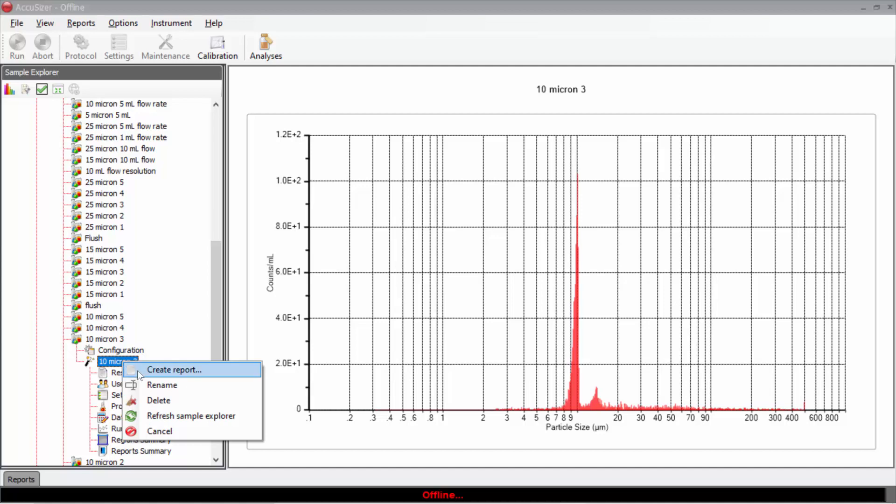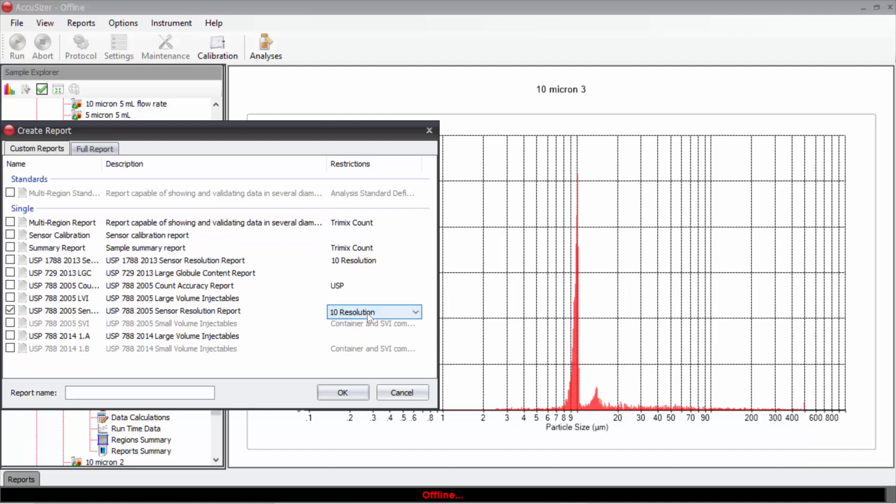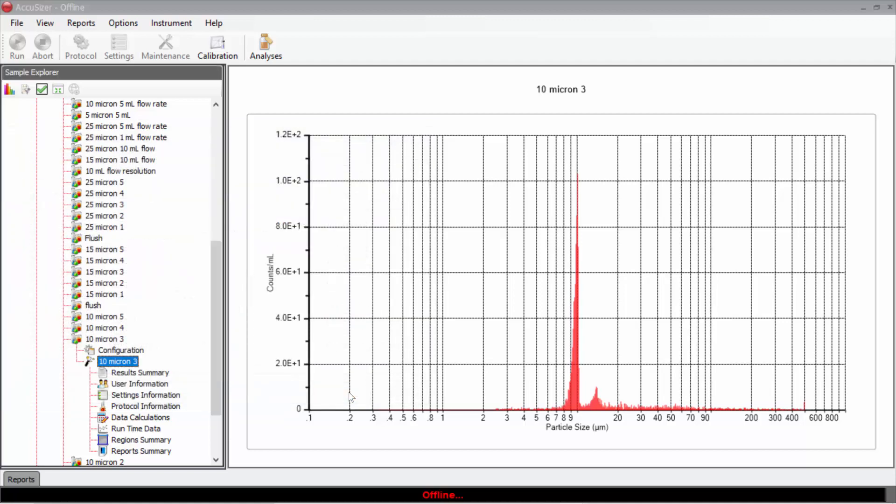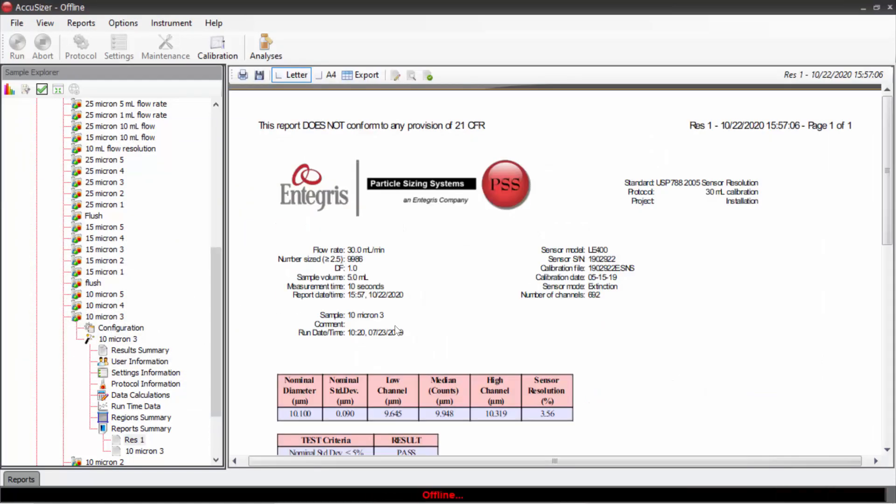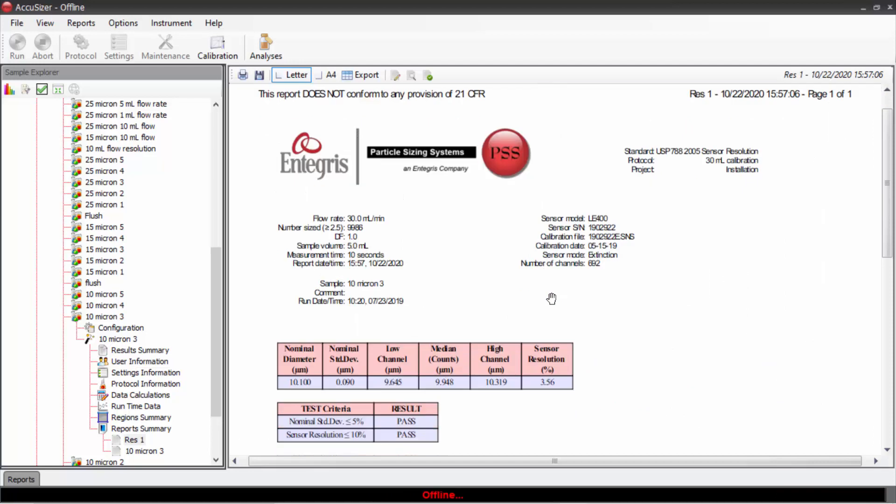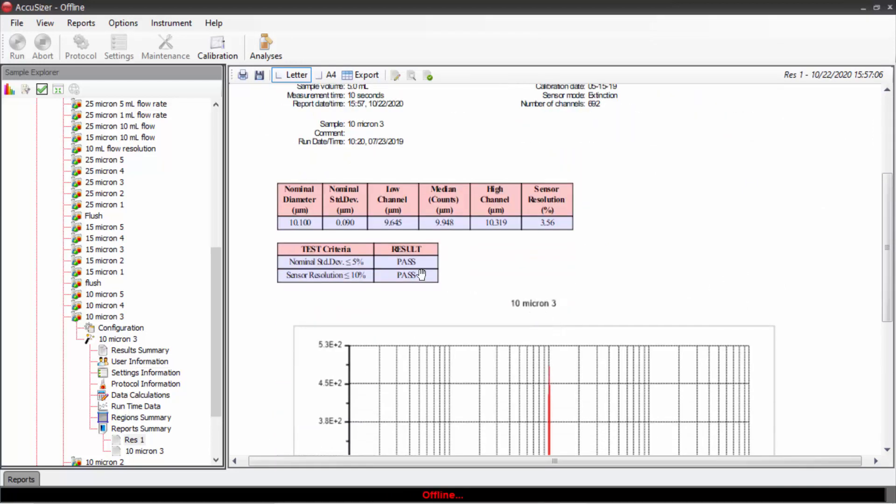And then I can create a report. Go to sensor resolution report here. And I've created the information which I just entered into the analysis region definitions. I will give a file name. It will now automatically generate that report. And here we see the results where the sensor resolution was 3.56 and it will pass.